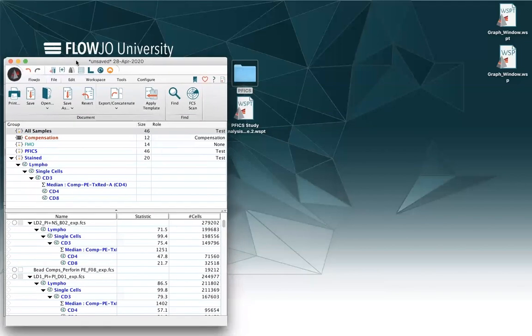If you want to use a template, you can also select the option of the magnetic gate, and allow the gates to be automatically allocated, like in this case.